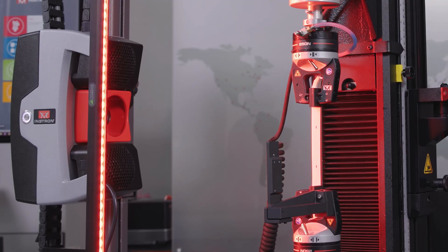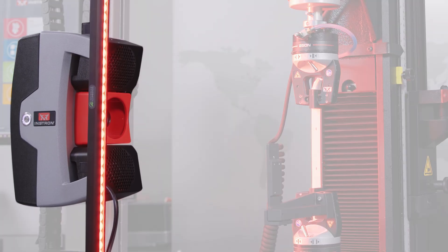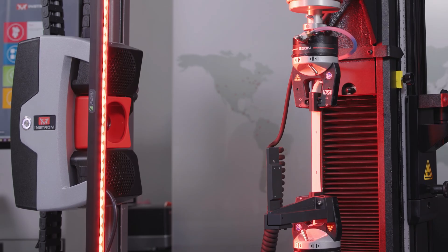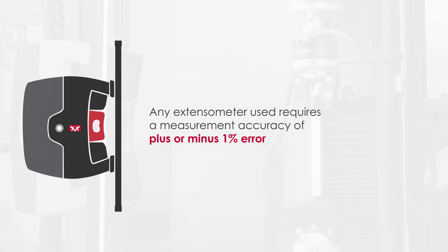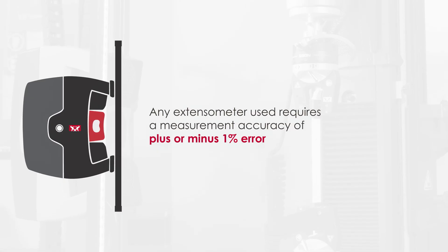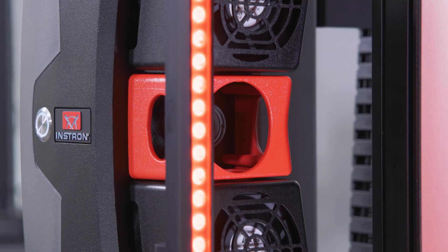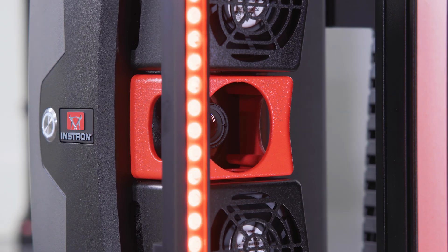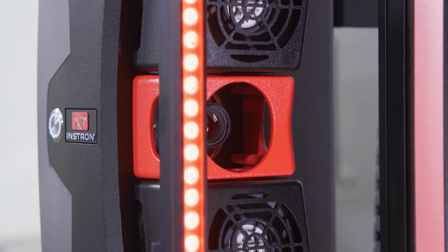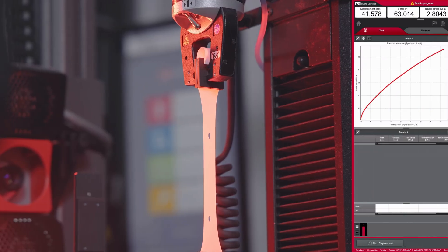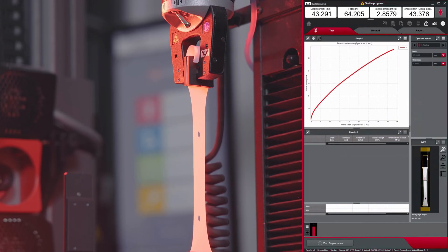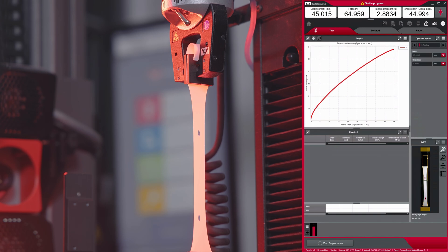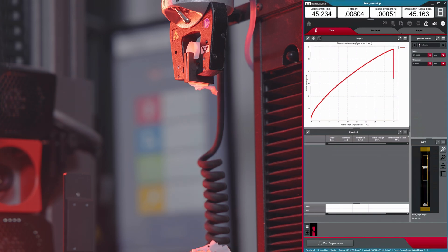It is recommended to use an extensometer for calculating modulus results. Any extensometer used requires a measurement accuracy of plus or minus 1% error. Instron's AVE Advanced Video Extensometer is a non-contacting solution ideally suited for measuring strain in delicate specimens such as thin films.